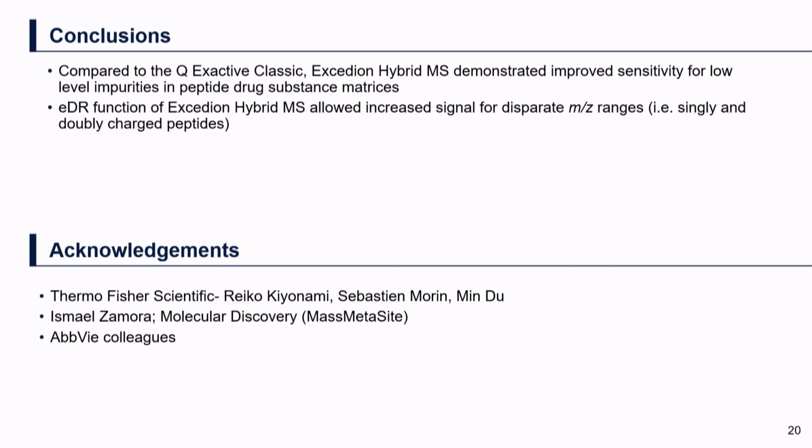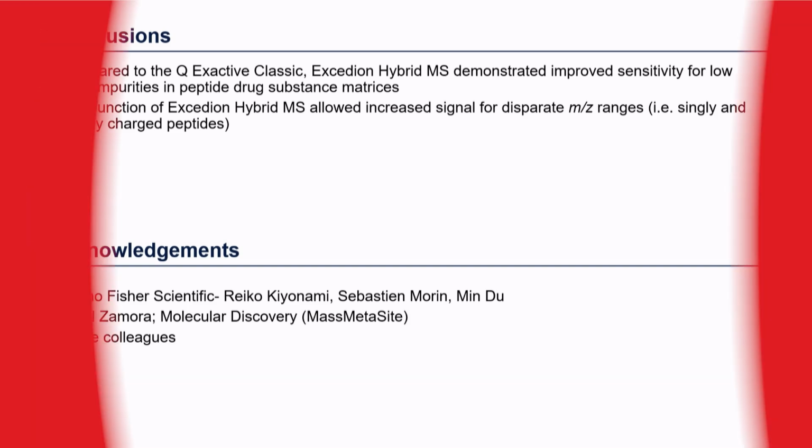Yeah, so it does double your scan time. So you do have to be conscious of your total cycle time and your scans across the peak. I will say for my purposes, when I had it on versus off, I did not notice a significant degradation of the mass spec signal or the peak shapes or anything. So it didn't seem to have a significant impact if you set it up carefully.